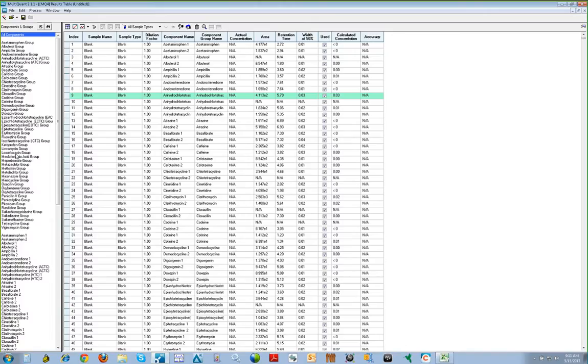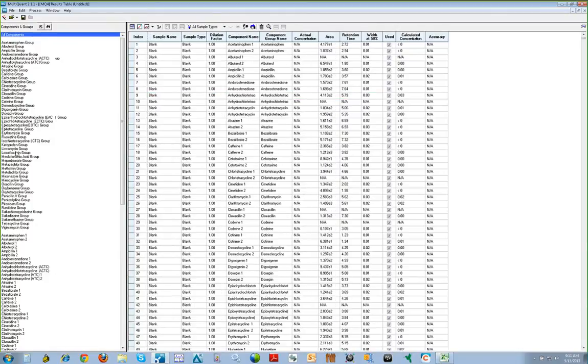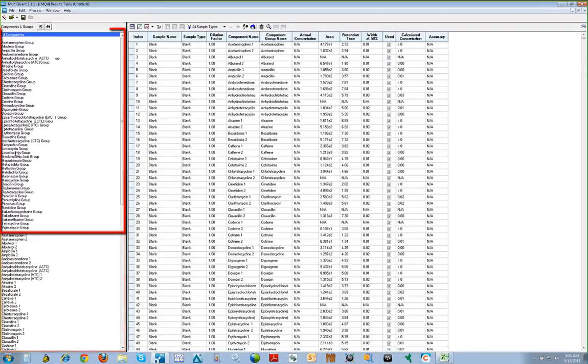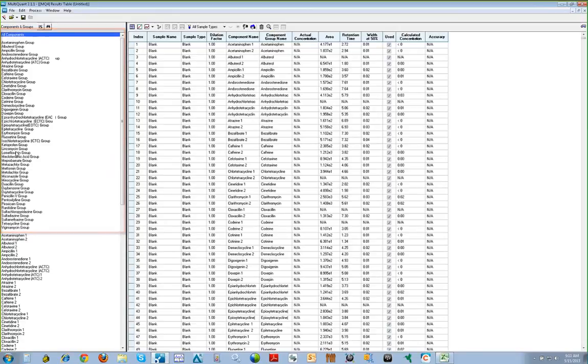The results table will appear with a navigation bar on the left-hand side of the screen. The navigation bar can be configured to display each transition you are monitoring, or individual components which are listed at the bottom of the navigation pane, and can also be configured to display groups which are listed at the top of the navigation pane if you've set up your quantitation method with groups.